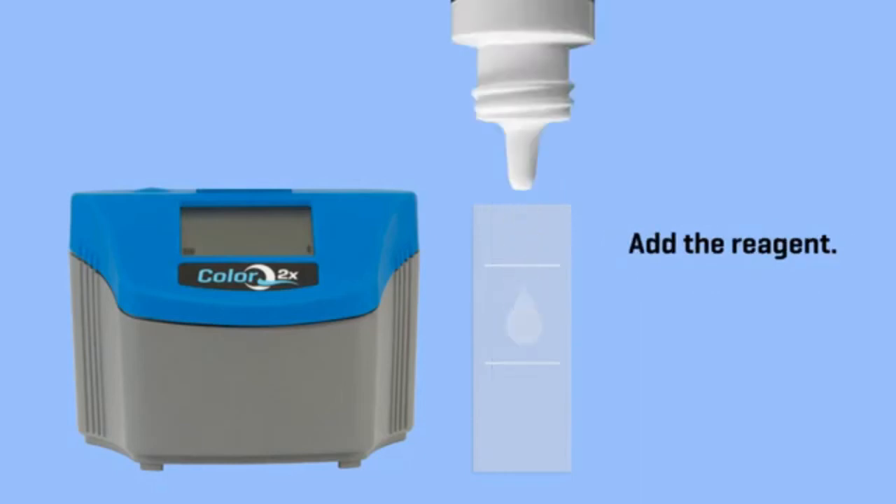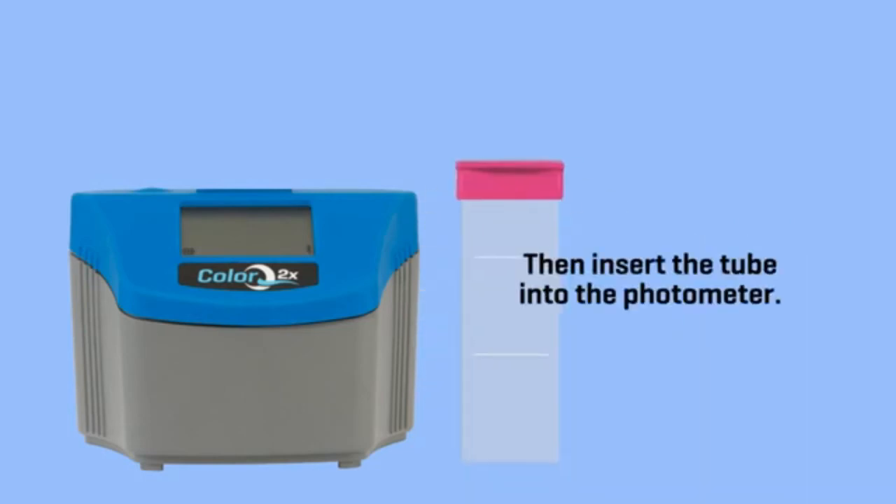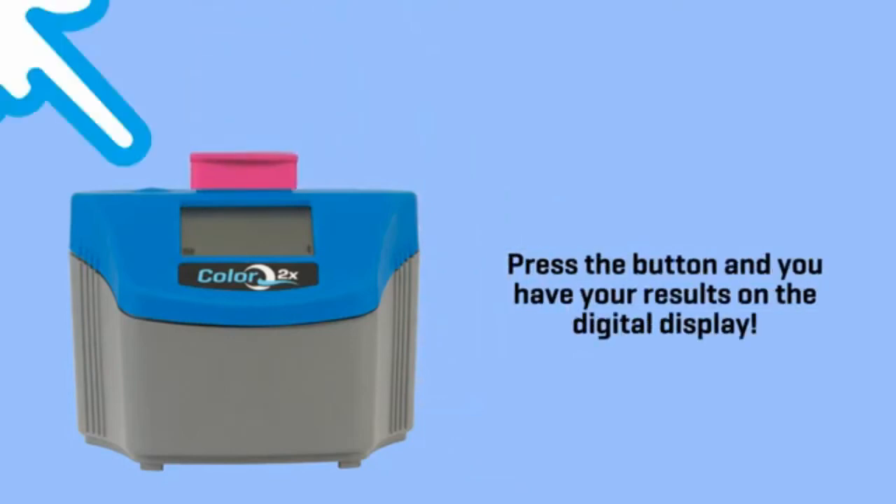Add the reagent, then add a color-coded cap. Mix, then insert the tube into the photometer. Press the button and you have your results on the digital display.